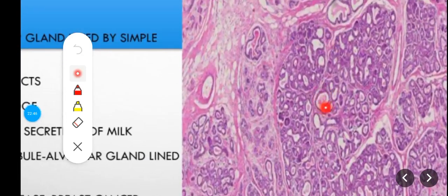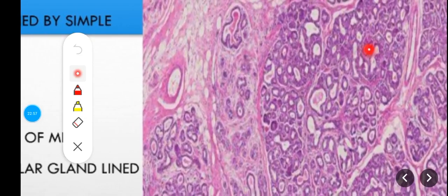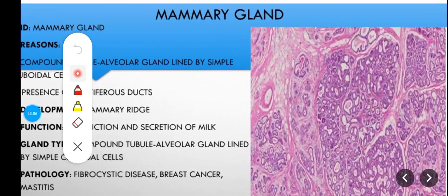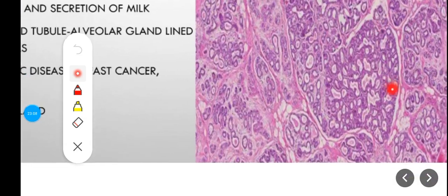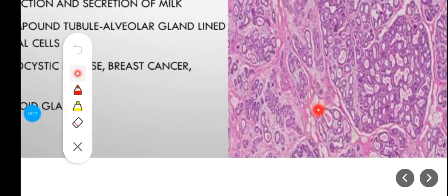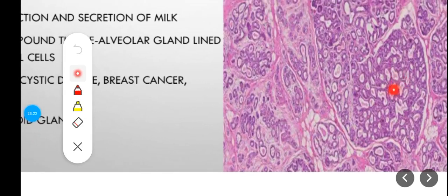Now, within the lumen, you find some eosinophilic substance within the lumen of the alveoli. And then inside the eosinophilic substance, you see some white spaces, which represent fat droplets. So they appear kind of vacuolated. You can appreciate more of that on this side, and this is the eosinophilic substance. Then the fat in the stroma, the fibrofatty stroma. So the alveoli make up the lobules.